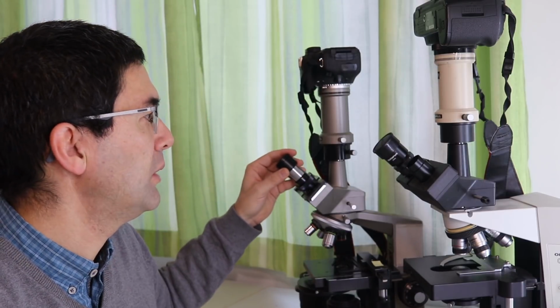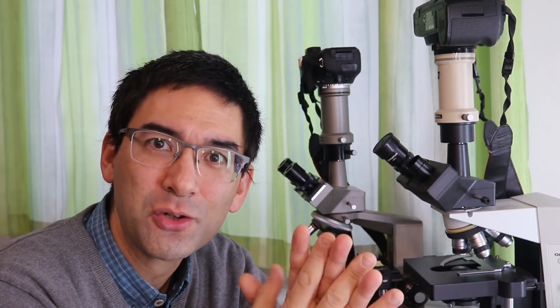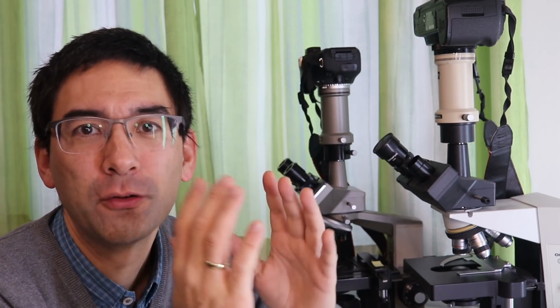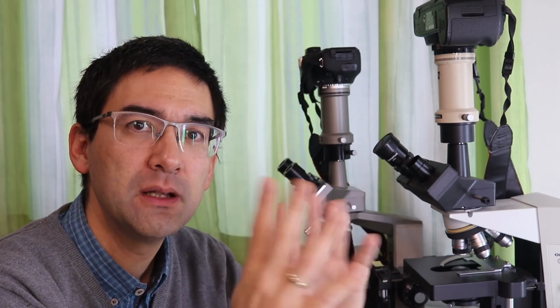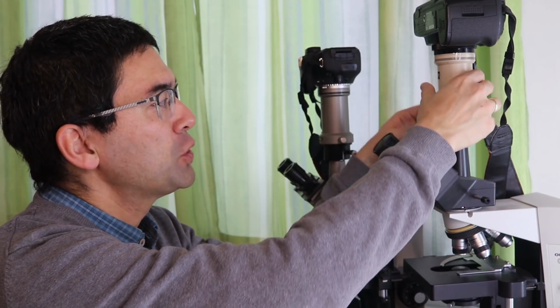Okay, so what else do I want to say? There are also eyepieces, so-called special purpose eyepieces. Actually, you shouldn't call them eyepieces. I like to call them photo projection oculars, or some people call them photo eyepieces. And not every microscope has this, but some manufacturers, especially if your microscope is not manufactured anymore, like for example these here, have special purpose eyepieces.